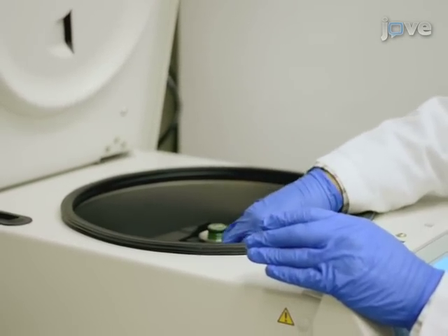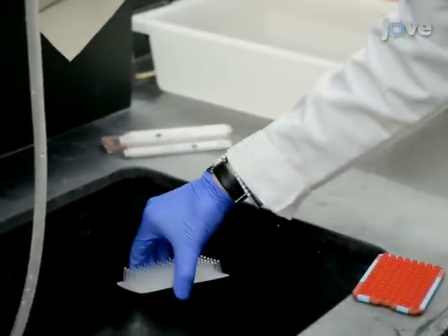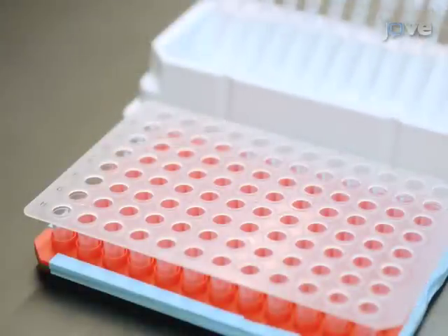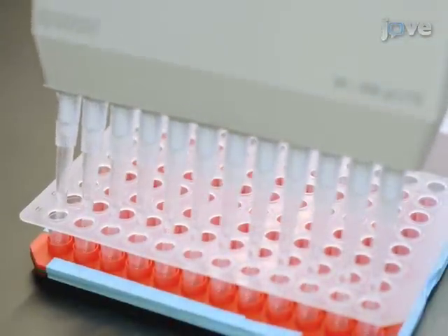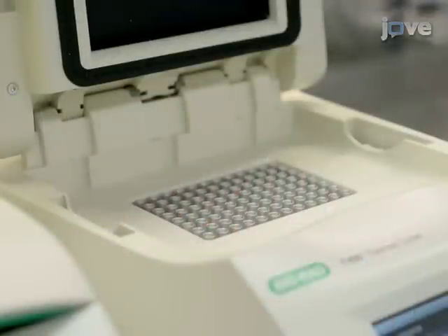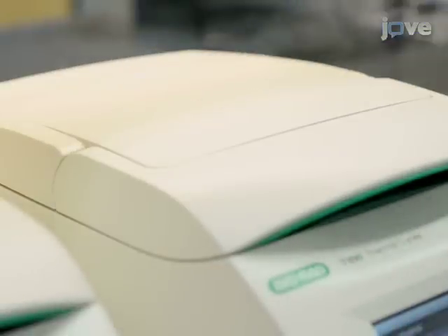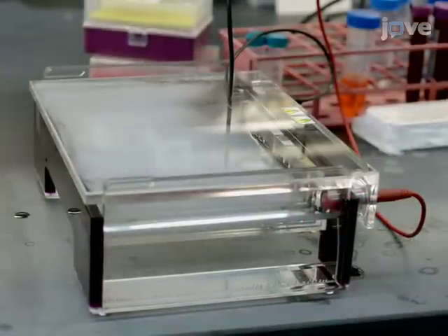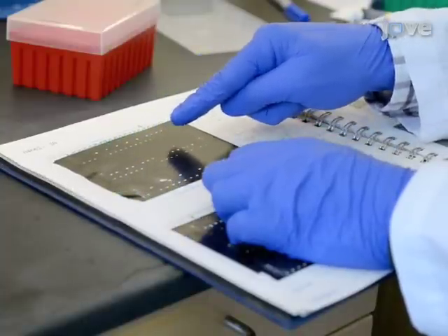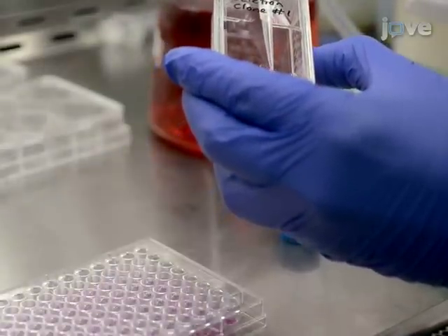Centrifuge the PCR plate at 400 times G for 5 minutes and remove the supernatant by flicking the PCR plate over a sink. Add 50 microliters of DNA extraction solution per well and resuspend the cell pellets. After genomic DNA extraction, run PCR reactions to detect non-deletion and deletion bands from the clones. Resolve PCR products on a 2% agarose gel at 10 volts per centimeter using 1x TAE buffer.